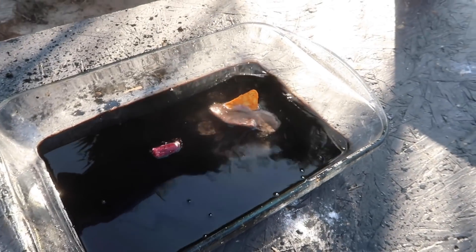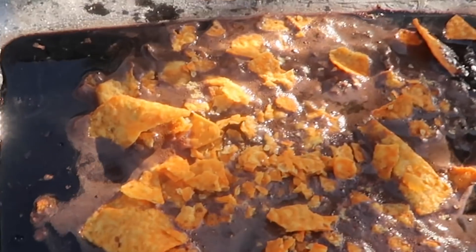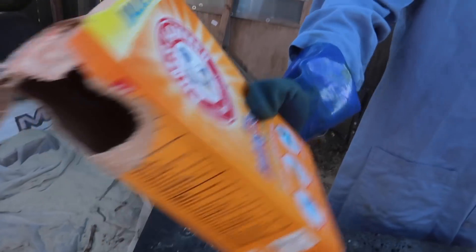For the Dorito test — oh, that's kind of clean. Anti-acid coming in hot.